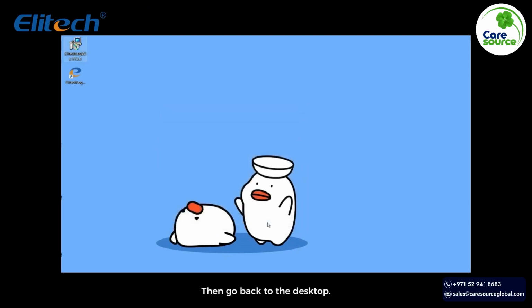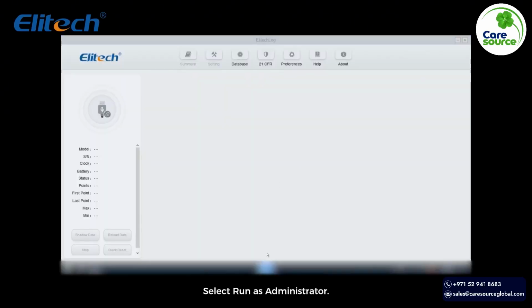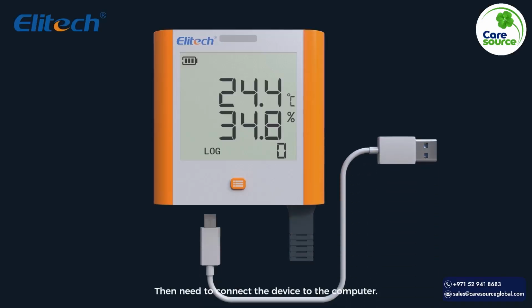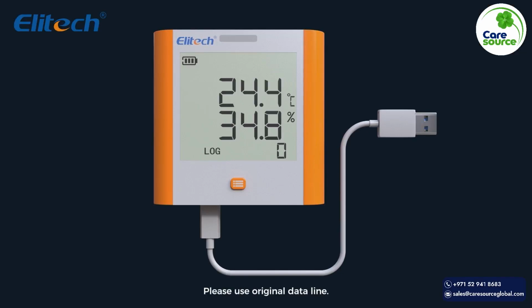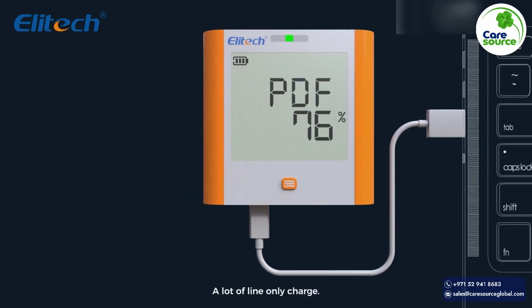Then go back to the desktop. Double-click to open ELITechLog. If double-click fails to open, you can right-click the mouse. Select Run as administrator. Then you need to connect the device to the computer. Please use the original data line, or a data line with a data transfer function. A lot of lines only charge.